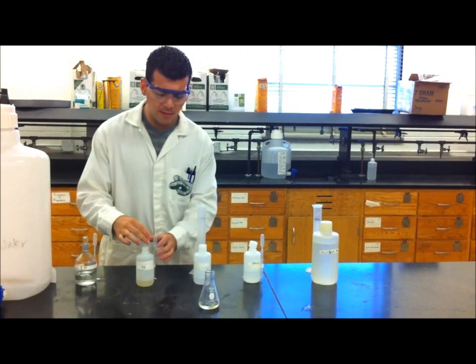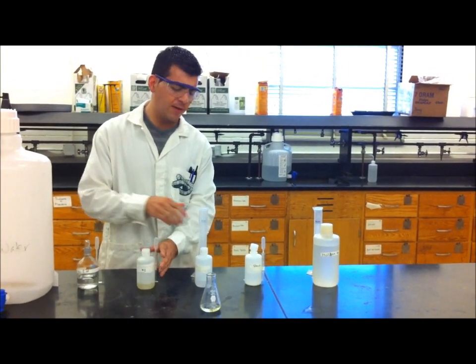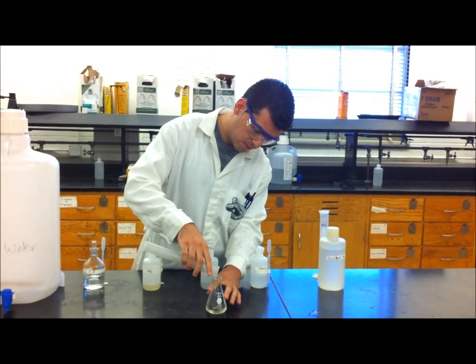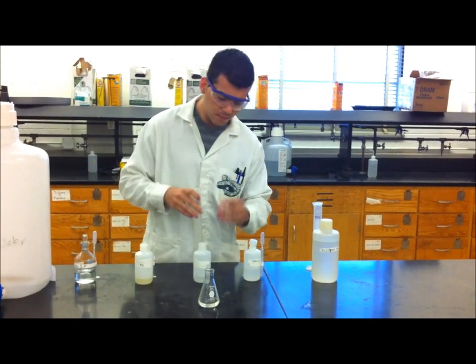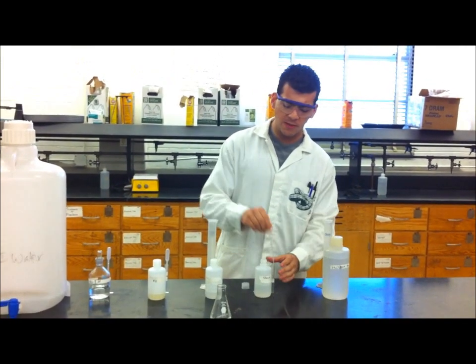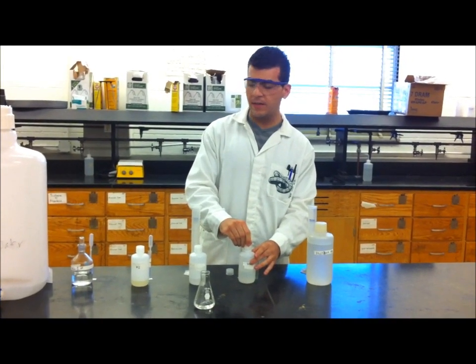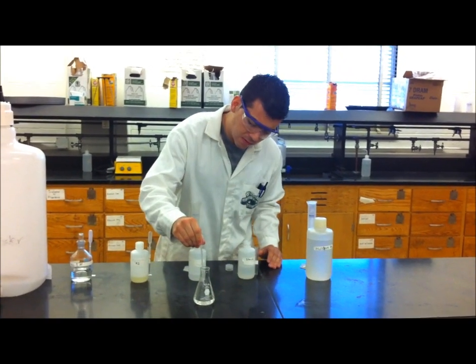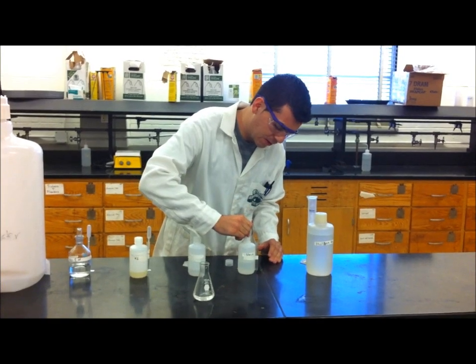You will use ten milliliters of sodium thiosulfate to accomplish this. Next you will add two milliliters of starch. The starch will react with the remaining tri-iodide ions to create a color change.